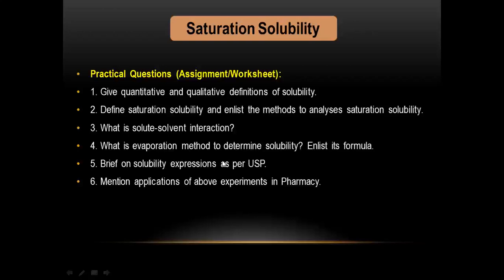So this is the small explanation and demonstration of the experiment, determination of saturation solubility. I hope this video will be helpful for you all, and thank you.